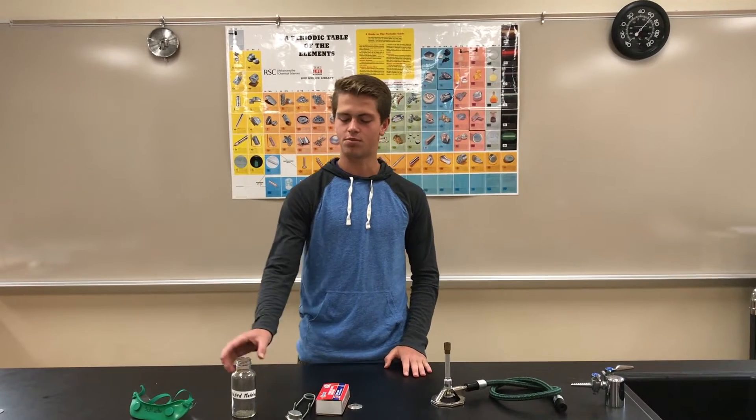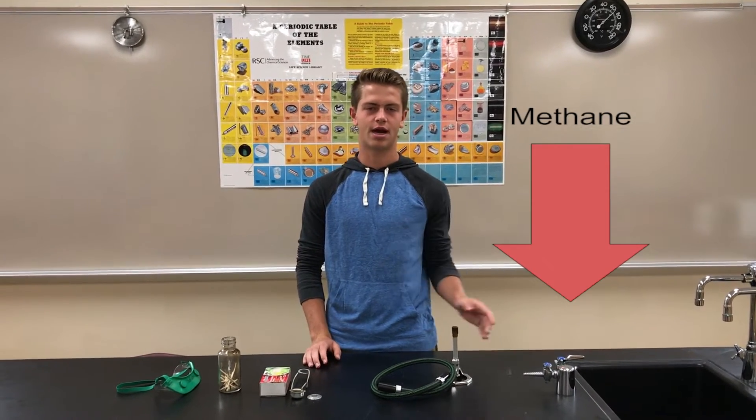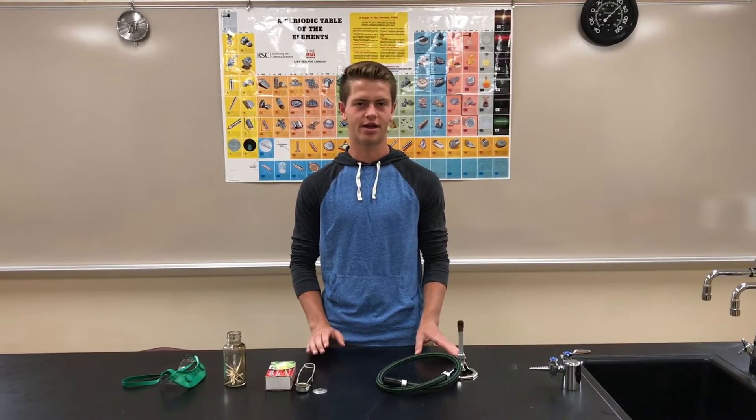This is a Bunsen burner. It's a very common lab device used to heat things quickly and efficiently. To light a Bunsen burner you need the Bunsen burner itself, matches or a flint lighter, somewhere to put the matches if you're using matches, goggles, and an active gas line. A Bunsen burner works by combining methane gas from the gas line with oxygen from the air and combusting it to create a hot flame.